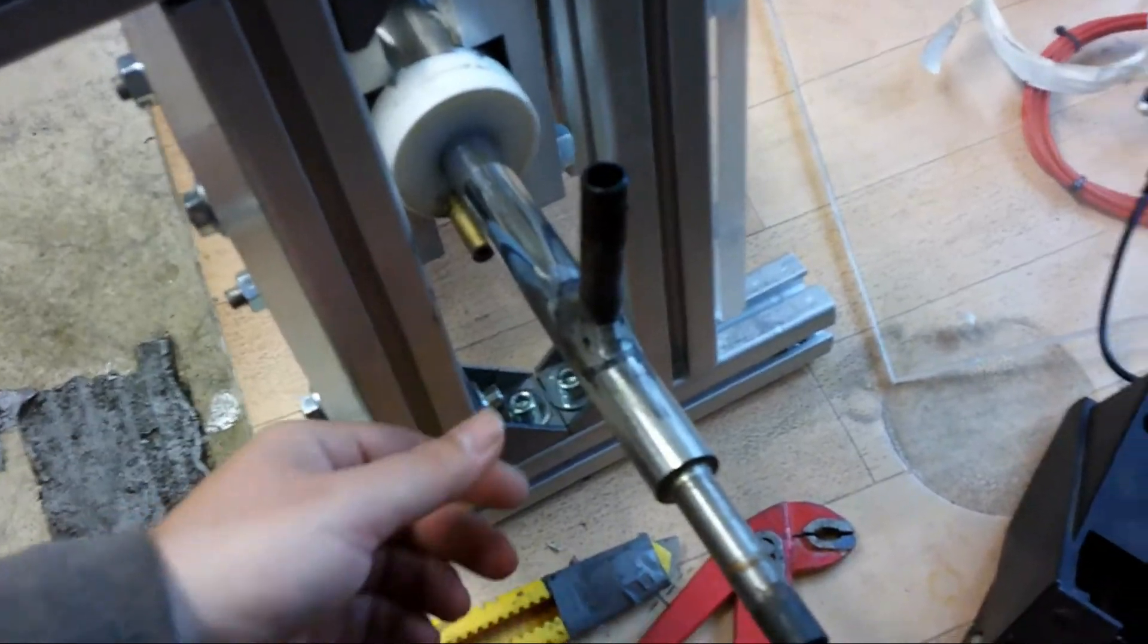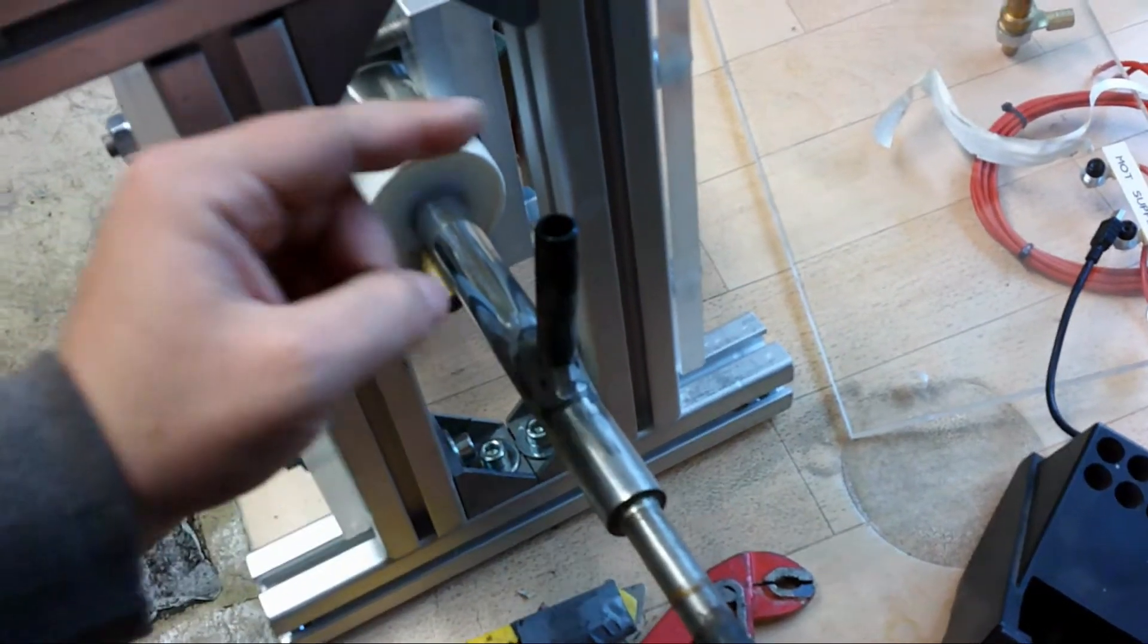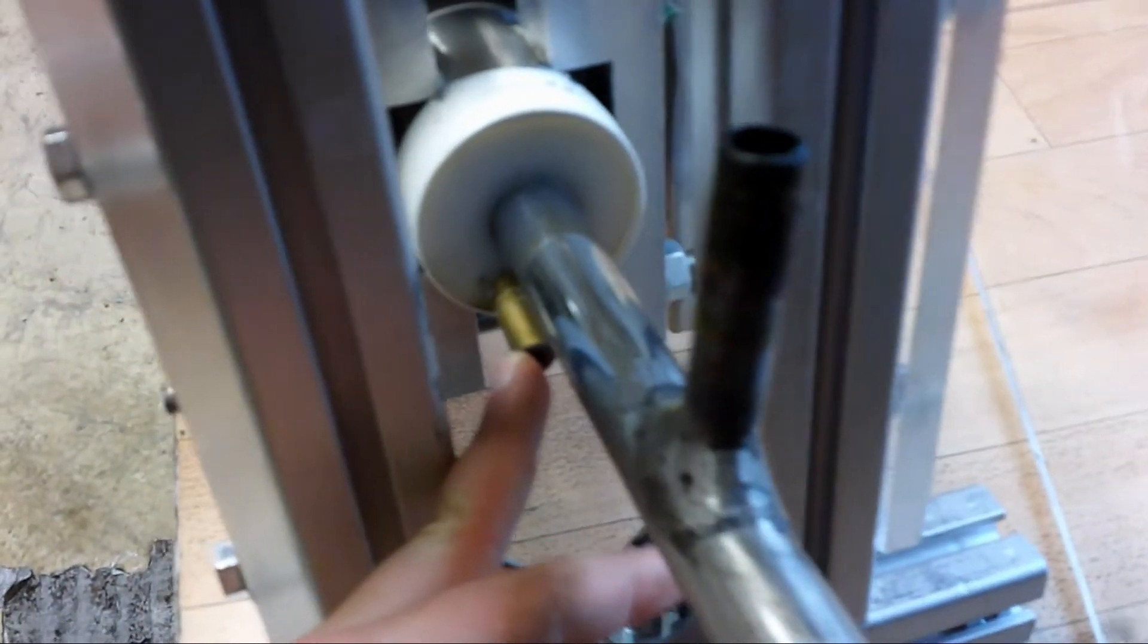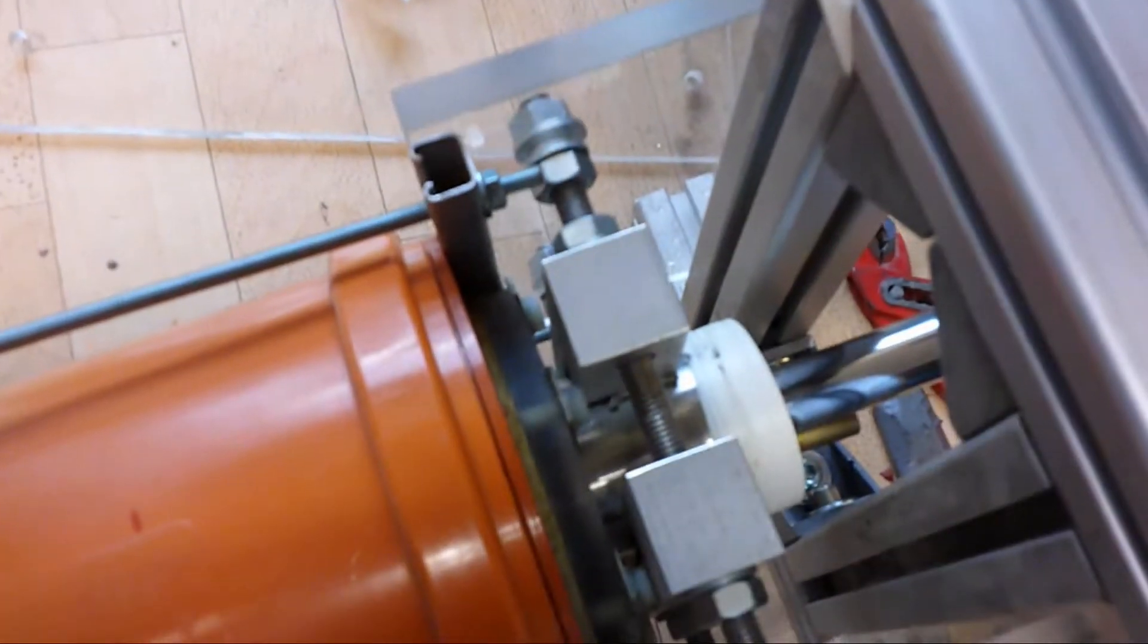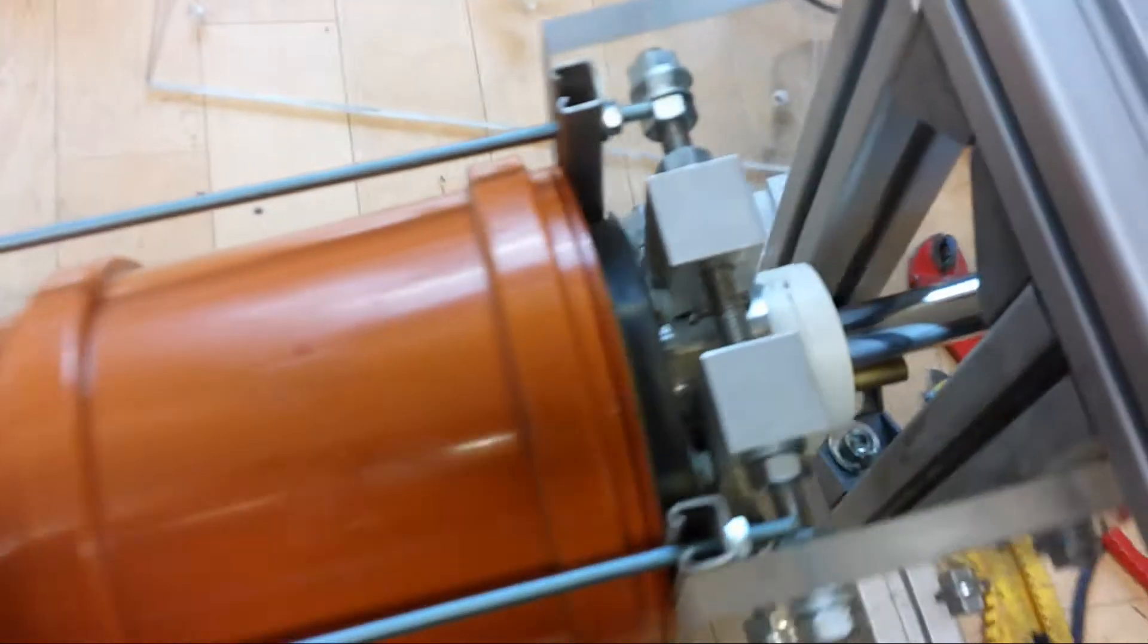So here you can see the inner electrode a little bit better. There is the water cooling of the inner electrode. That is the inlet and that is the outlet. And here was the gas outlet for the NO2 gas. Now I am going to disassemble it completely.